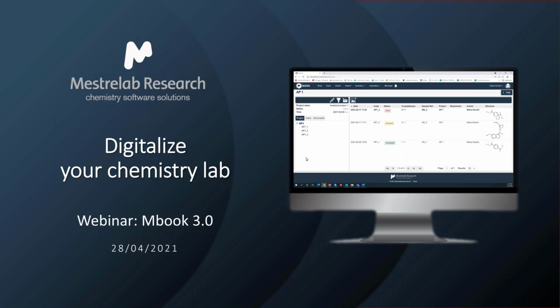Good day to everyone. Today we are going to talk about Mbook 3.0, a new release, and most importantly, how to digitalize your chemistry lab.